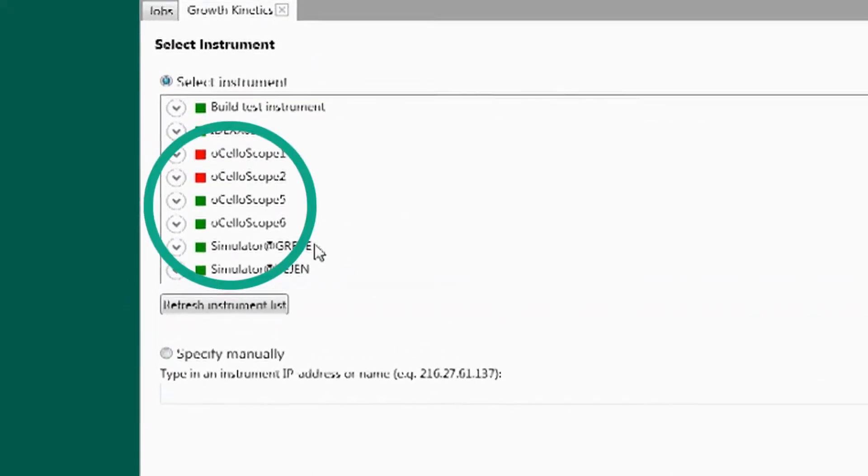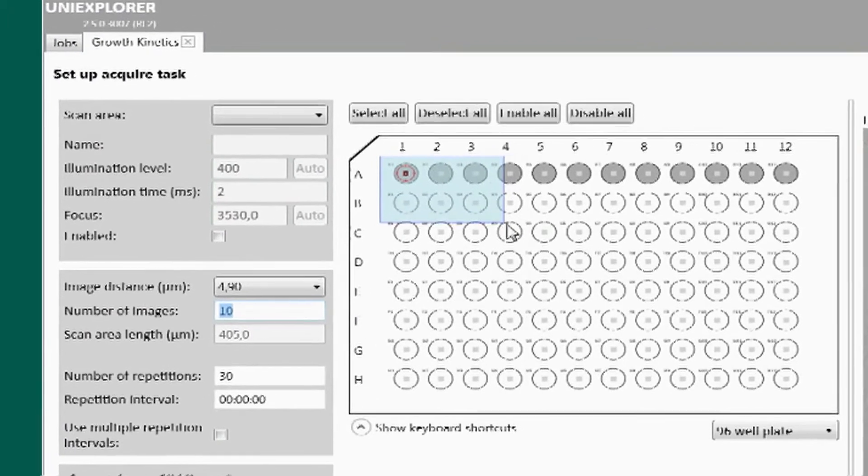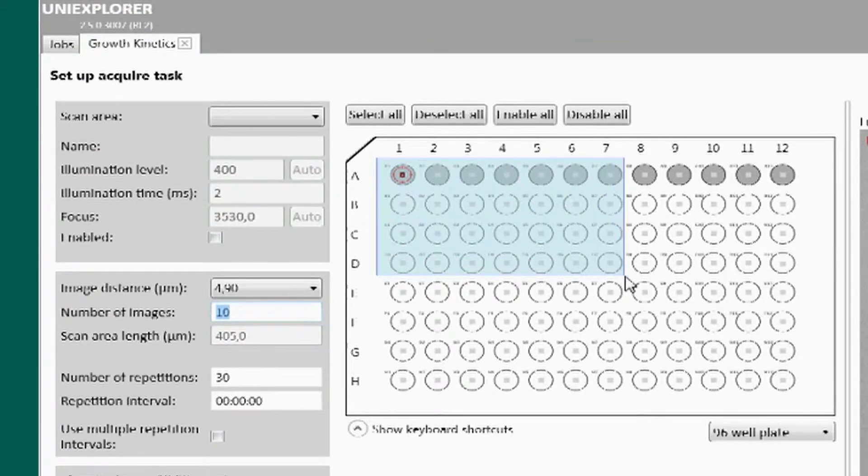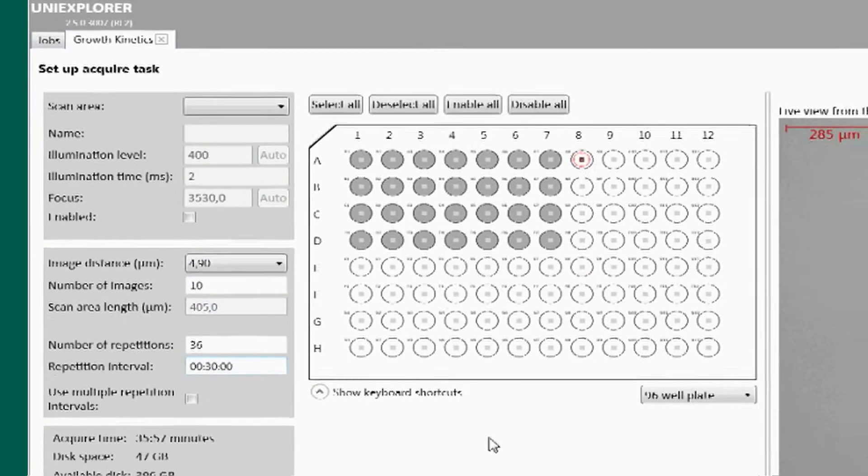If more than one Ocelloscope is present on the network, the relevant instrument is chosen from the list. Finally, the individual wells that are to be analyzed are chosen, as well as how long the measurement should last and how often the sample should be scanned.